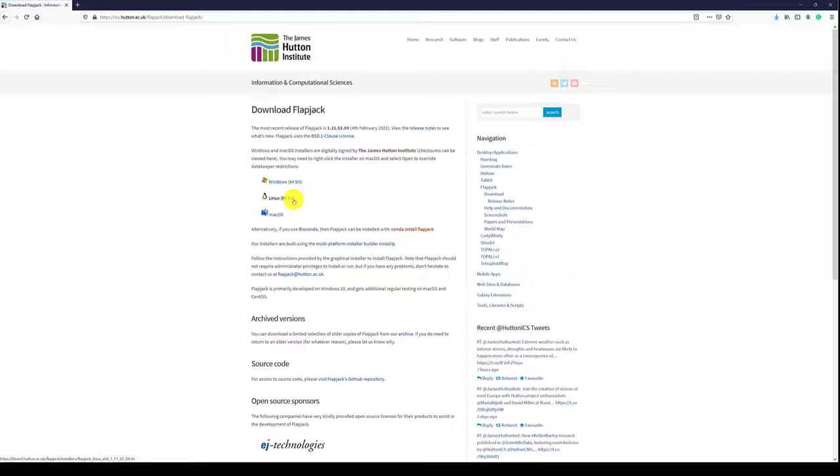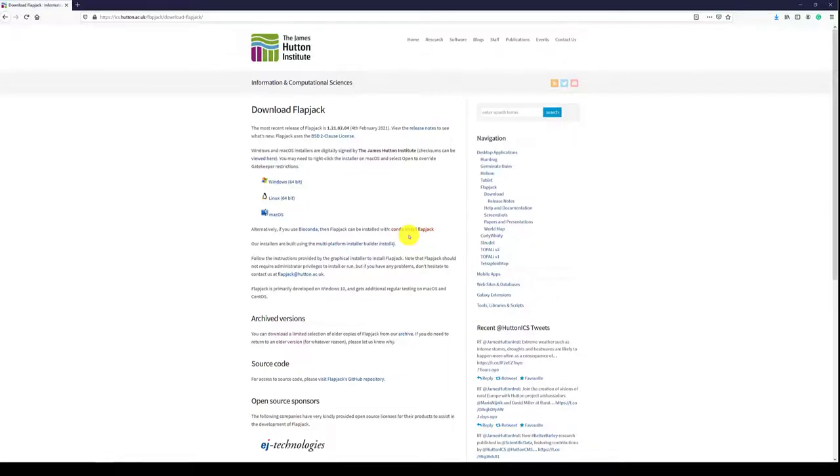If you use BioConda then Flapjack can be installed with conda install Flapjack. In this tutorial we will use the Windows 64-bit version as an example.